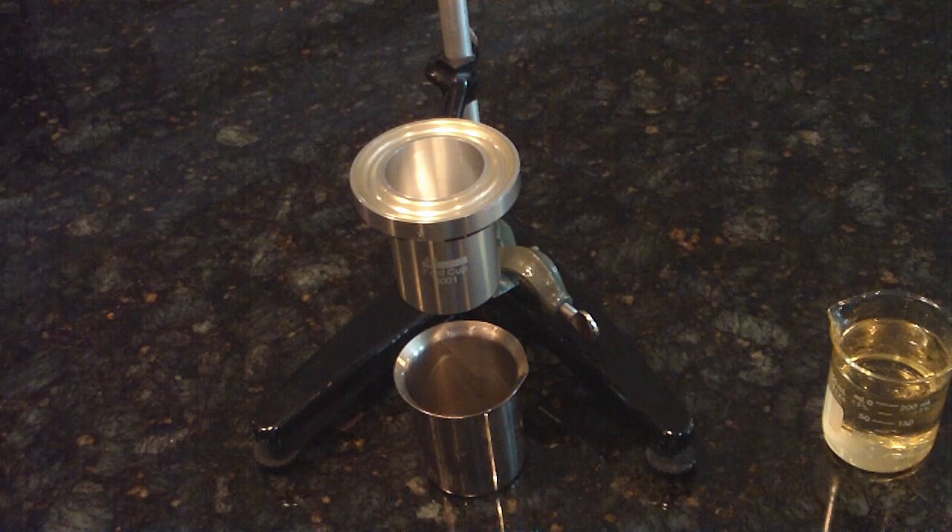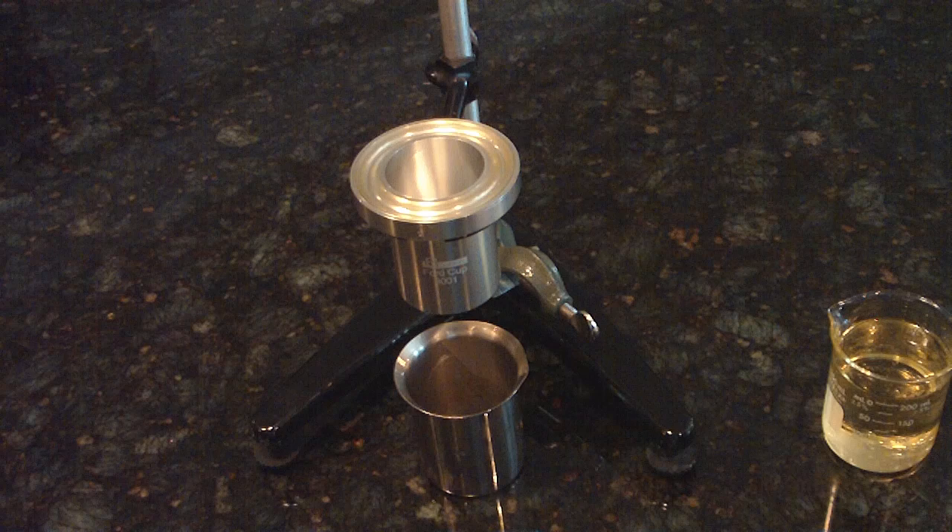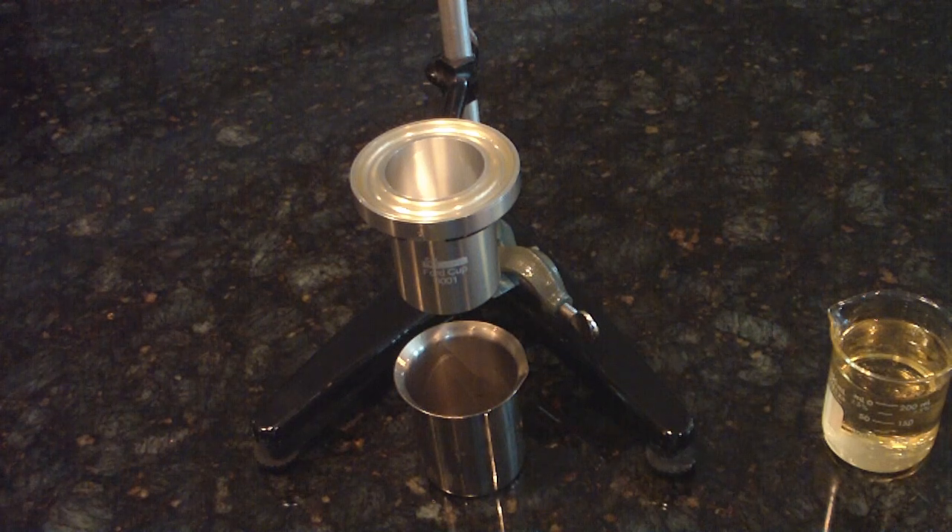A demonstration on how to use a Ford cup. First, you select your cup number two, three, or four to provide a test of efflux time within the range covered by the attached table, at a controlled temperature of 25 degrees centigrade.